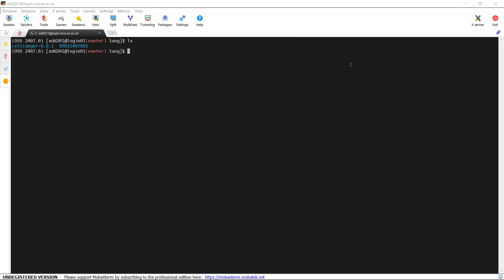Hello everyone. Welcome to my video tutorial for single cell RNA sequencing data analysis. In my previous video, I showed you how to download Cell Ranger and install it on a high-performance computer. Today, in this video tutorial, I'm going to show you how to analyze the raw sequencing data using the Cell Ranger software.